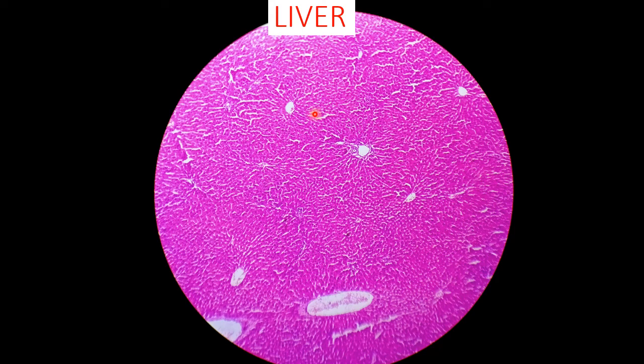Next is the liver slide. The liver you can easily identify. Observe the hexagonal-shaped lobules called hepatic lobules, and we can identify a pale structure called the central vein. From the central vein we can identify spokes of a wheel. Some structures running peripherally are called hepatocytes, and all the hepatocytes are lined up in a straight line like that. So they are called hepatic laminae.